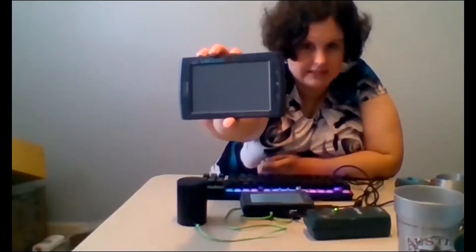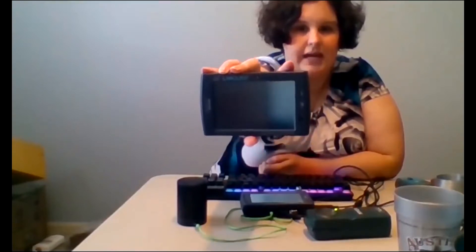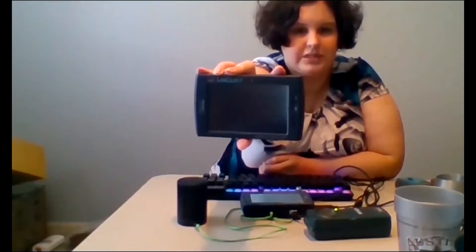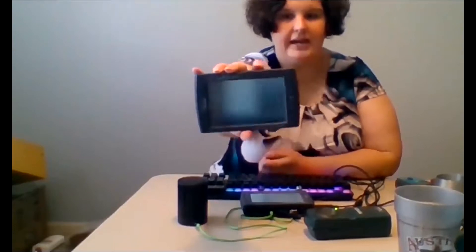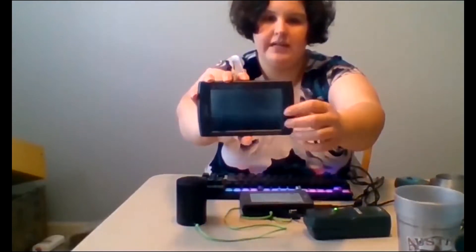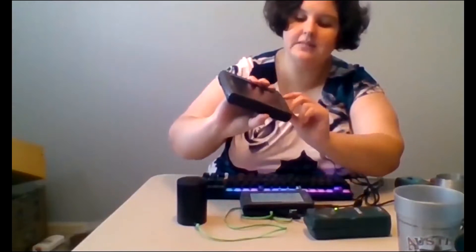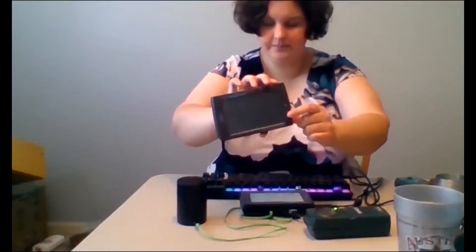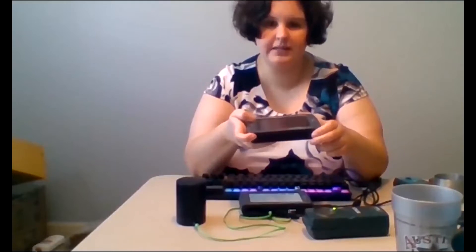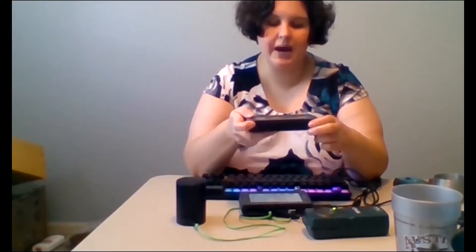I'm holding up the Talking LabQuest. It is a box that is about four inches long by one inch high by three inches wide. When you hold it on the desk, it will have three physical buttons to your right. Those buttons are a collect button, a home button, and a back button. With those physical buttons to your right, what's going to be on the left is a power button.